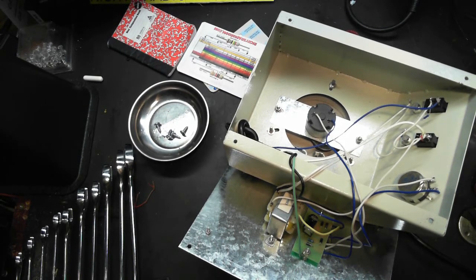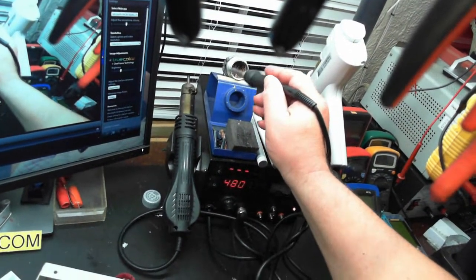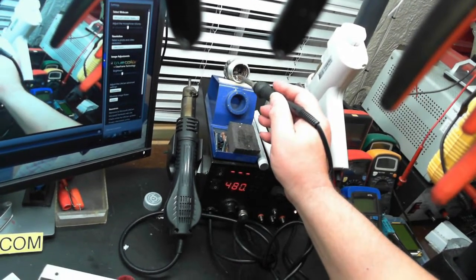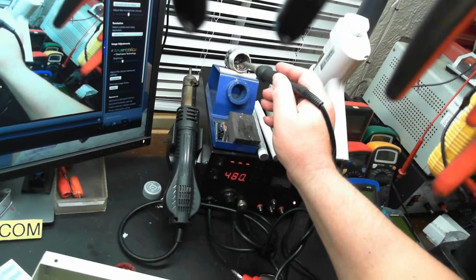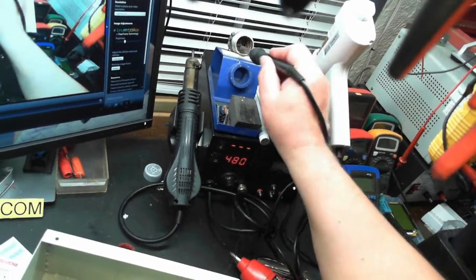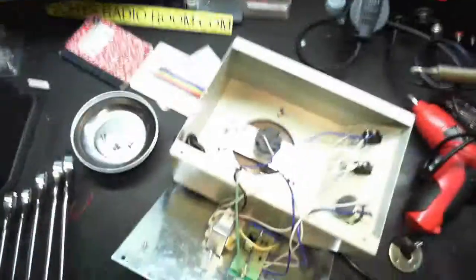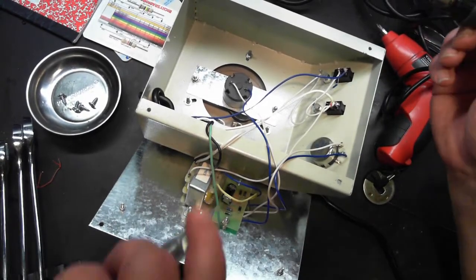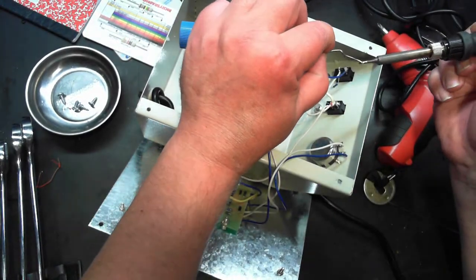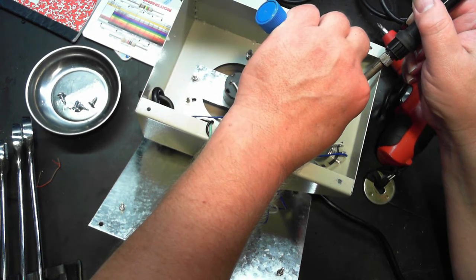That same metal mesh I've got in a really tight. I suppose I could show you it. This is actually a piece of electrical conduit. And what I did is I packed that copper scrub pad in there, and took a hammer and just beat it right in there because it's nice and tight. You just rock it back and forth. Nice and shiny. And now, back to our show. Solder would be good, wouldn't it? A clean tip is essential. Pro tip.